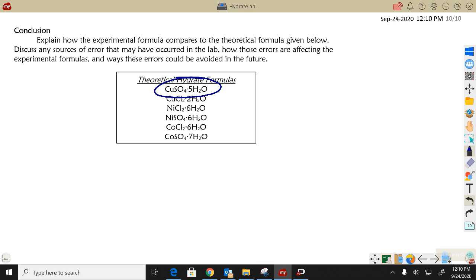And we're also not going to say things like, I don't think I did the calculations right. That is not a laboratory error. Then do the calculation correctly. Why would you submit work if you know your calculations are wrong? That's a you problem. Fix it before you turn it in, right? So doing the calculations wrong is not a source of laboratory error.